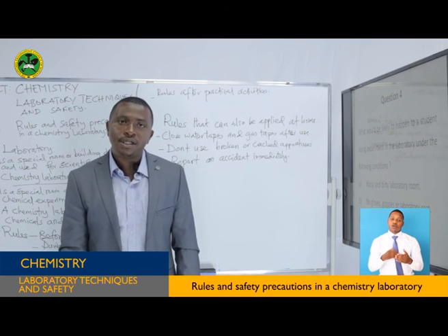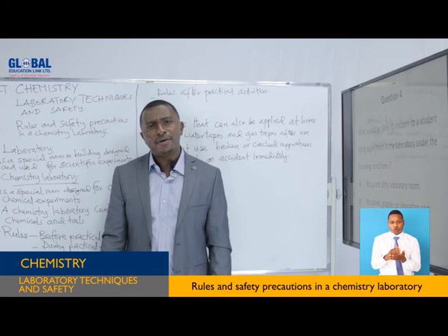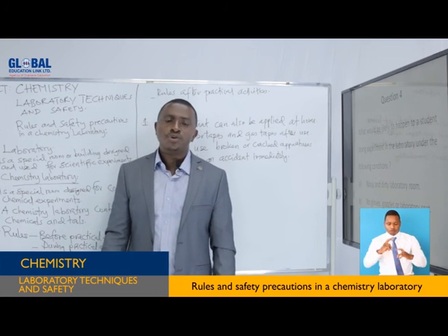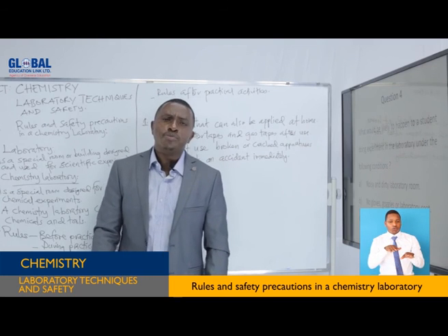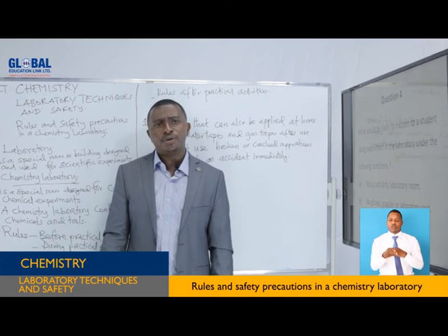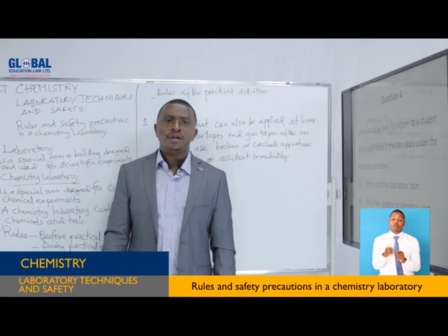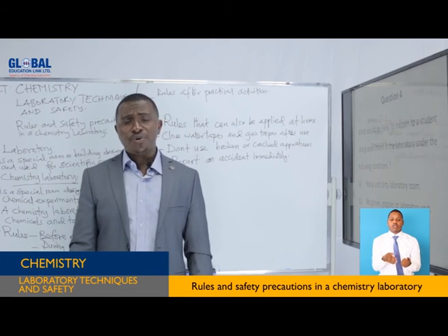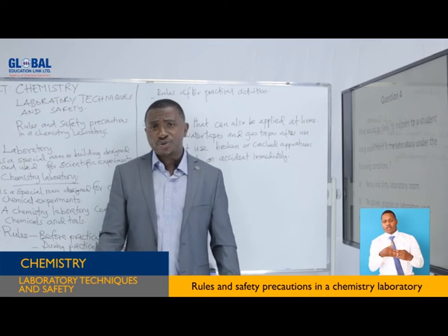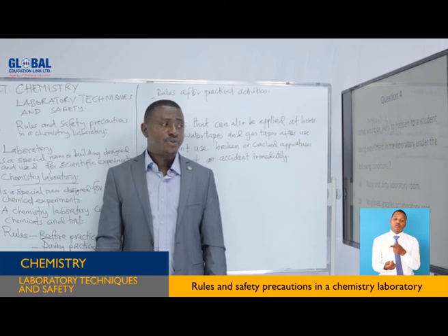Working in a noisy laboratory room removes the concentration of other students who are doing their practicals, so you will disturb them, move their attention away from their practical activities, and it can result in them getting wrong answers. But it also disturbs you when you are working in noisy conditions. It can disturb you and you may fail to collect the required data. So you are advised not to work in a noisy laboratory.